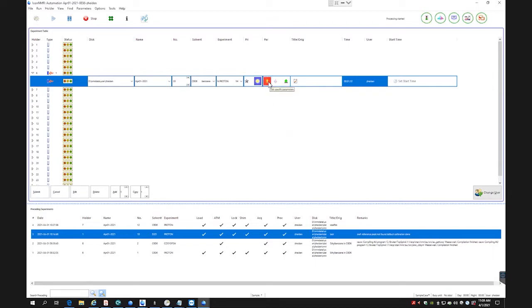You see this kind of apostrophe here, or this exclamation point. This states that you changed the default parameters. That's okay, it doesn't really mean anything. And then there's really nothing else you can change besides setting your title. So we'll just type sample IconNMR and click set title.